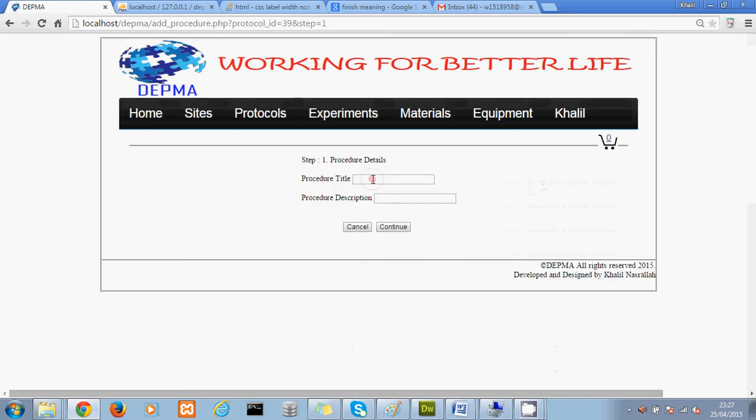Add a procedure. We have to enter a procedure title. Let's give it the title: procedure for the new protocol. Procedure description: this is the new protocol created for me. By clicking continue, it will forward me to the second step.